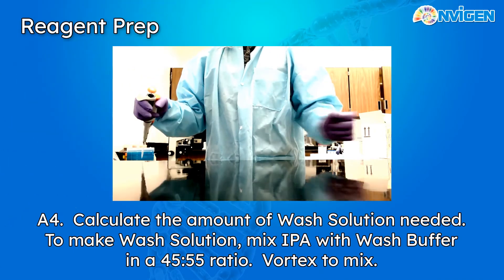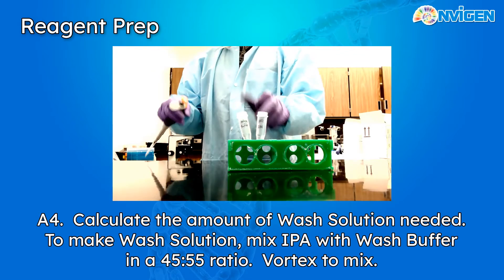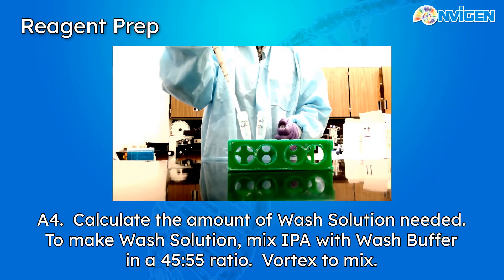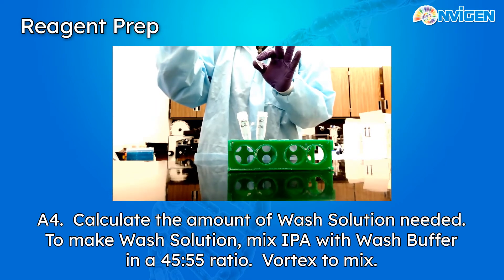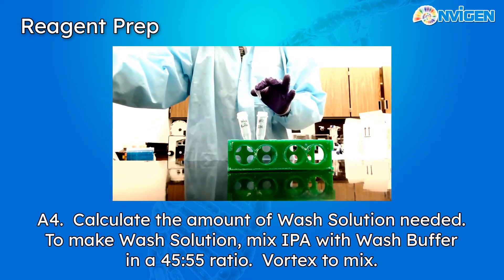For the wash buffer, calculate the quantity you'll need and add 450 microliters of isopropanol for every 550 microliters of wash buffer. The wash buffer is quite viscous — it has a syrupy consistency, so don't let that surprise you. Be sure to make a fresh batch of wash buffer for each experiment.